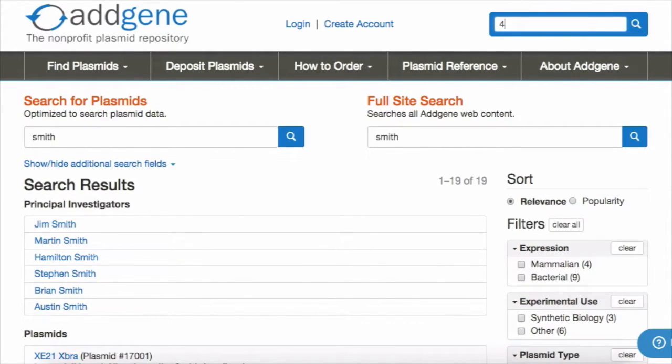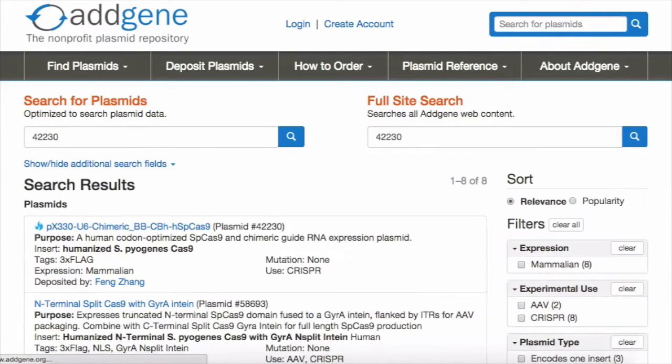If you know the catalog ID number of a specific plasmid you are interested in, you can enter that number into our search bar to access the associated plasmid information page.